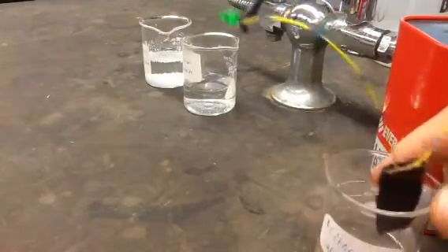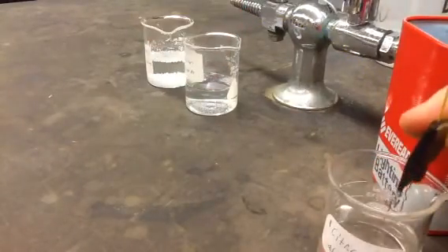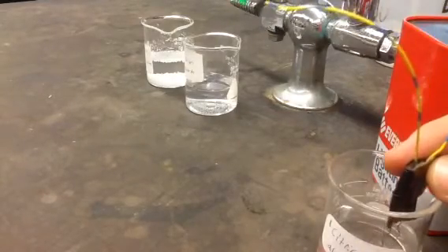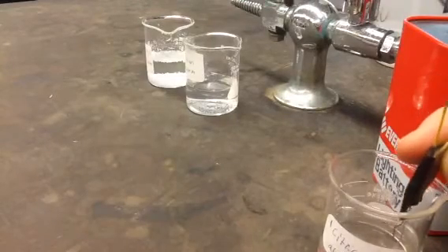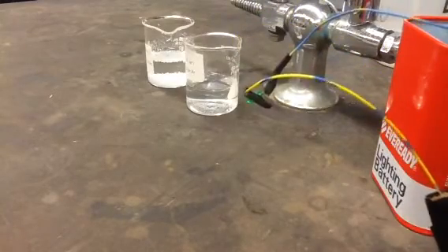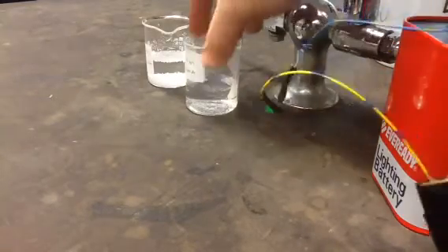Thank you. So we have our citric acid. I'm going to stick that in there. Now, citric acid should not be conductive. I have a feeling we might have cross-contaminated. We're getting a brief flicker, looks like it's flickering on and off. Is that what you're seeing? Yeah, so we're getting a little bit of conduction, but it's not overall very conductive. You can even put partial if you want. You know, it's somewhat conductive.